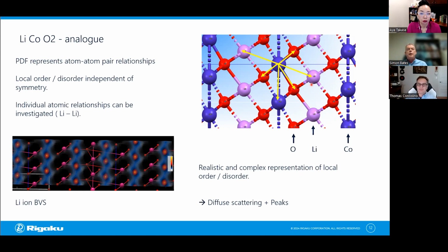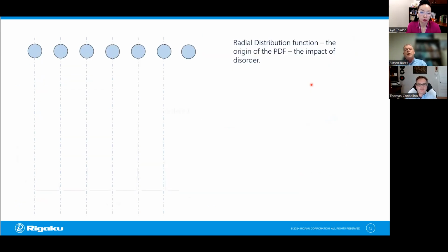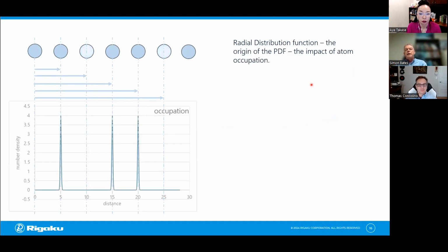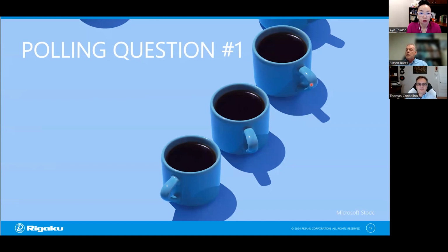So yes, very important. And I have indicated in the PDFs to follow that we can directly determine that distance from the PDF with no complicated analysis at all. Very easy. So that most important parameter we can get out very fast and very quick. Okay. All right. That's good for now. Thank you, Simon. Okay, we're good? Yep.